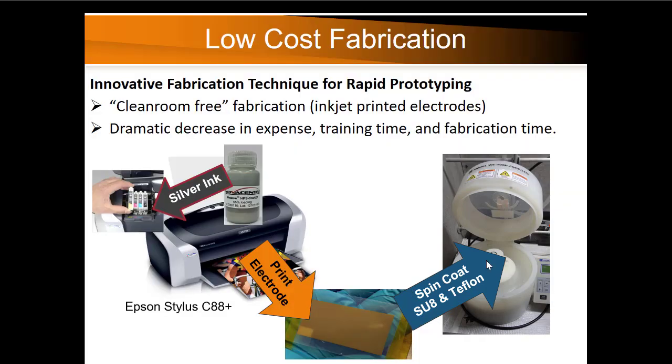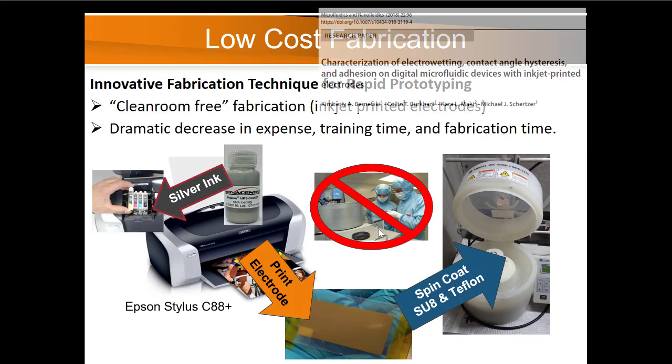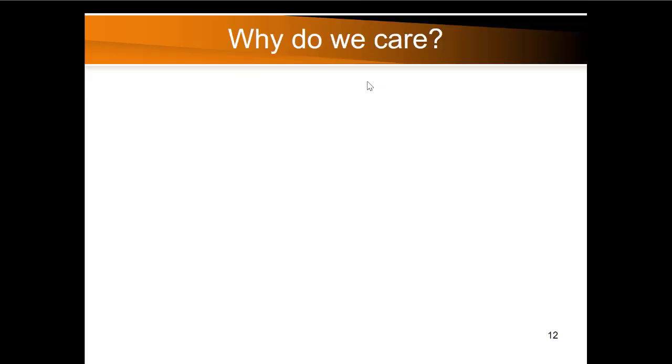It's less training, because in the clean room you do have to go through some rigorous safety training, and it's definitely warranted for the work that gets done in that lab. But for the stuff that we do, they still go through safety training, but they don't have to do the whole clean room safety training for things they're never going to use. So this is all nice because you never have to step foot in the clean room, right? This is a lower cost way to do this. We published a paper about this fabrication method in Microfluidics and Nanofluidics.